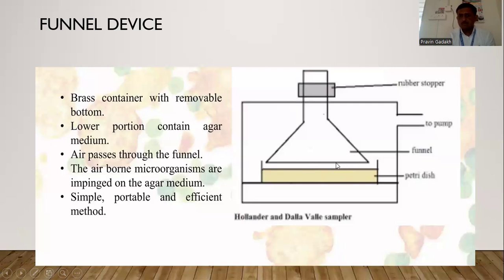After the completion of this process, we have to incubate the plate inside the incubator and observe it for the growth of different microorganisms. So it is a simple and portable device used among the solid impingement devices for the enumeration or counting of the different microflora present in the air.